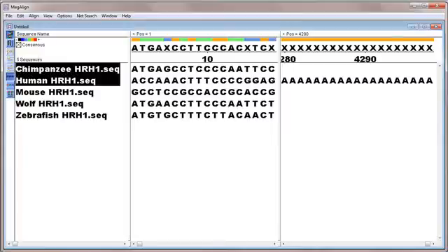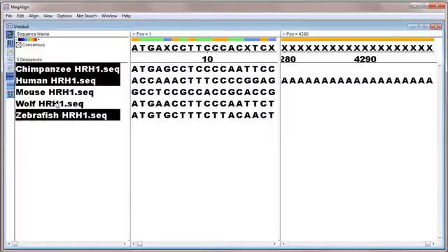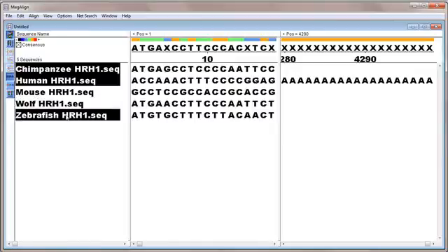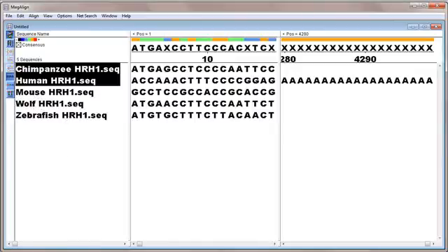If we select additional sequence names, all possible pairwise combinations will be aligned, each pair in a separate window. In this example, we'll just choose the histamine receptor sequence for chimpanzee and human.